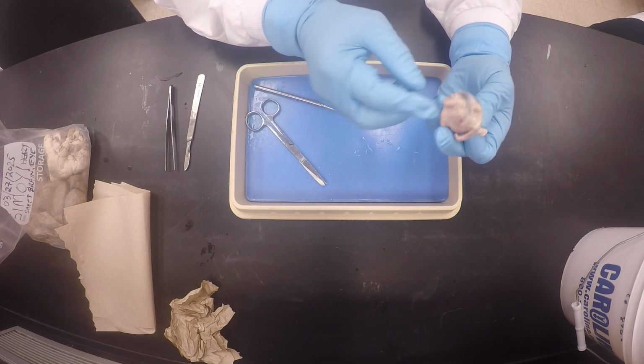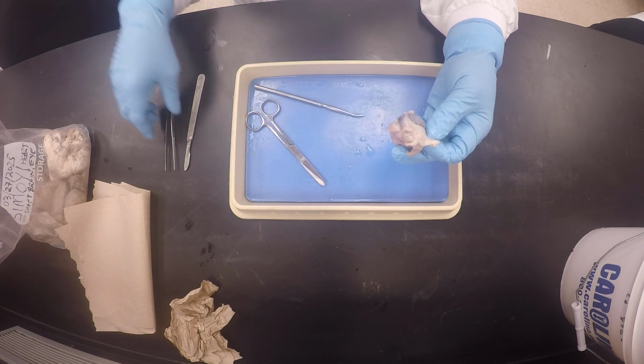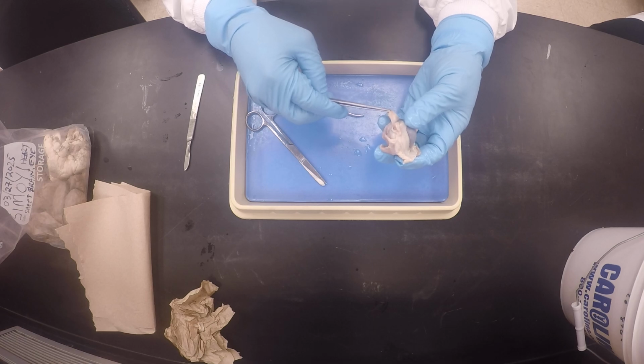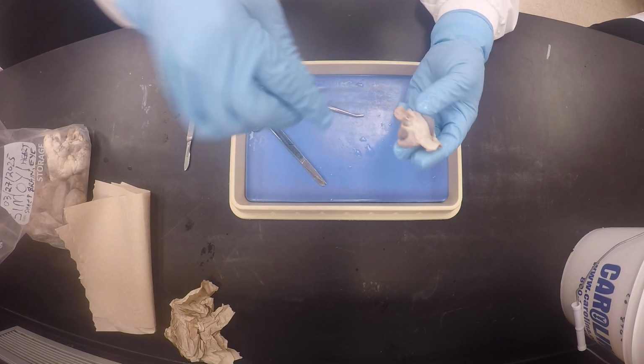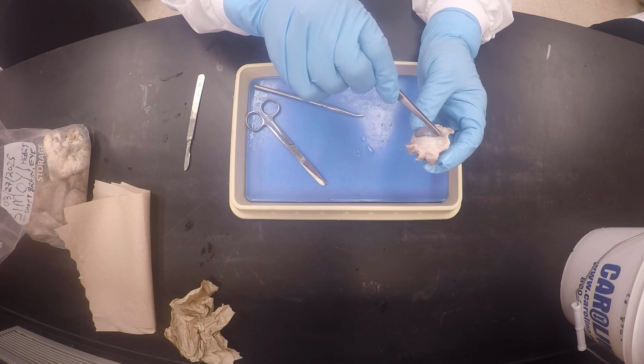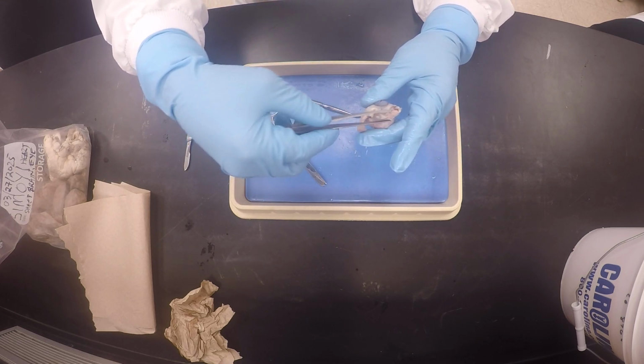Okay, so this is the short side, one muscle. So this is the medial rectus. And if this is the medial rectus, then by default the other short side has to be the lateral rectus. You see what I'm saying? And then you will see 2 muscles on that lateral rectus.